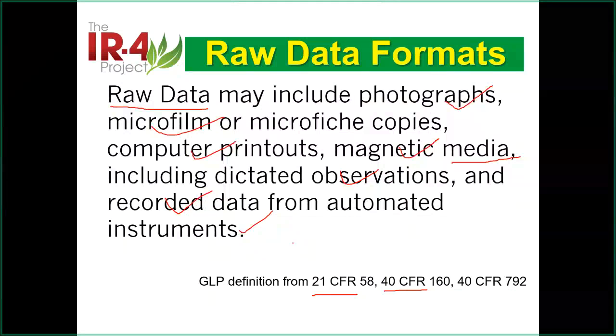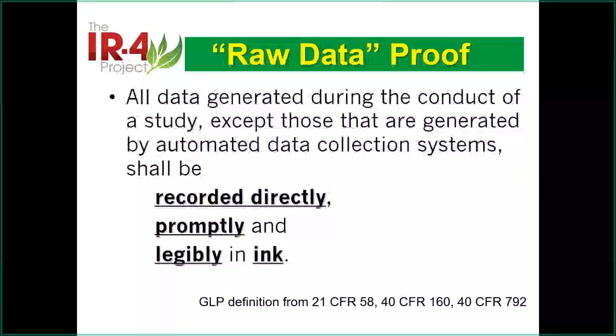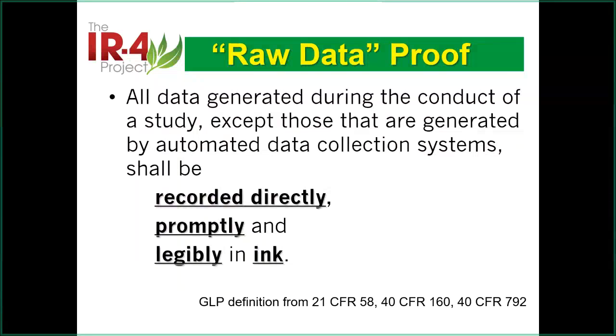We do electronic data and data keeping, so we are not going to go into too much detail there. We just talk about paper, which will be easier. If you cannot handle electronic data in your lab, it's better to keep it on paper. I would say it's safer. At this point, I don't have enough knowledge to do electronic data correctly, so I prefer paper myself.